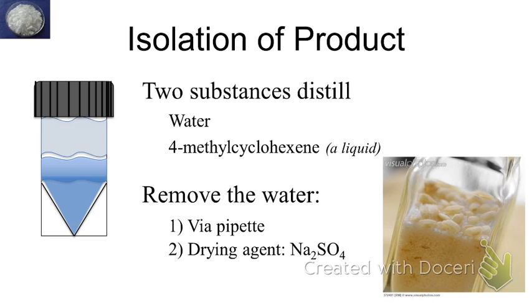Okay? By the end of this step, you should have a clear liquid. That does not mean that it's dry as you might envision your clothes. What we're looking at is the loss of water, not of liquid. How would you know that you've added enough drying agent? It'll be dry. How do you see it's dry? Because it's still a liquid. You say it'd be clear? Okay, you should expect to see it go clear. That can be helpful.